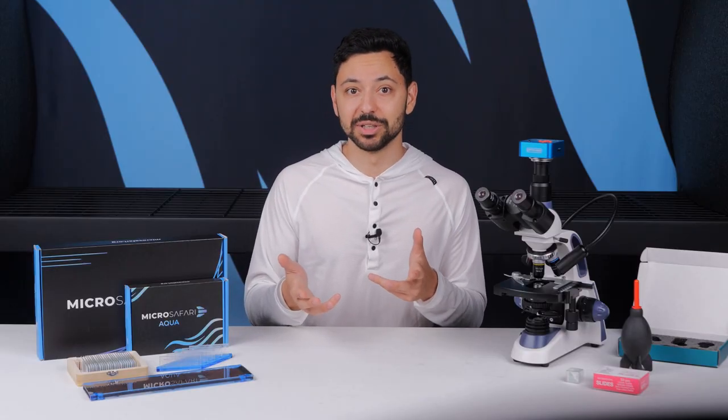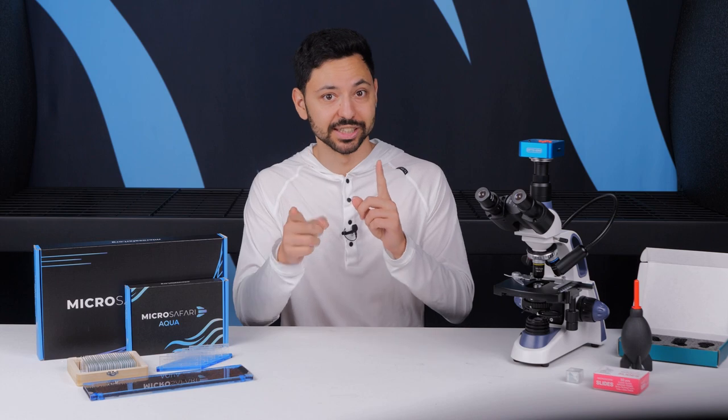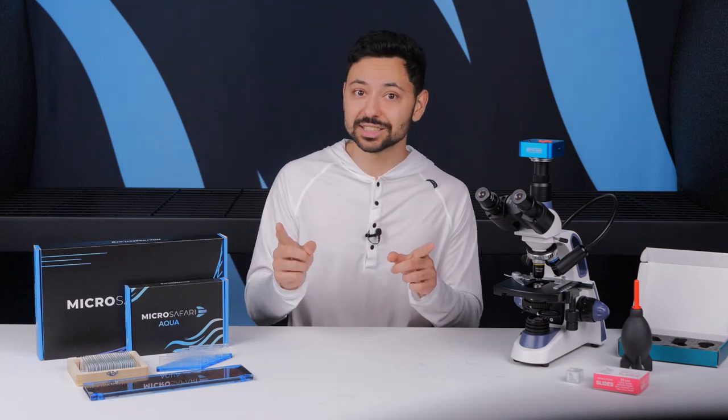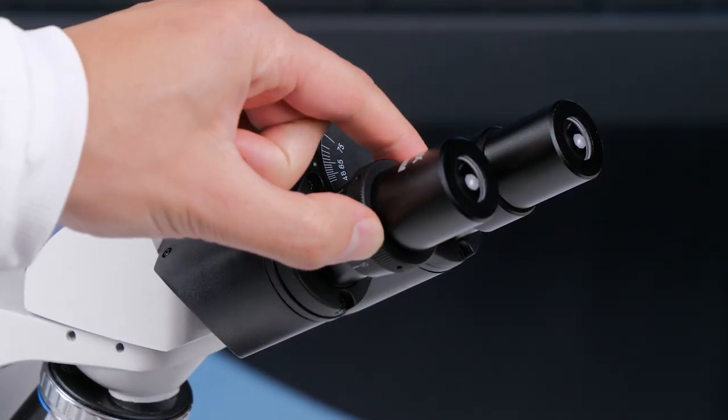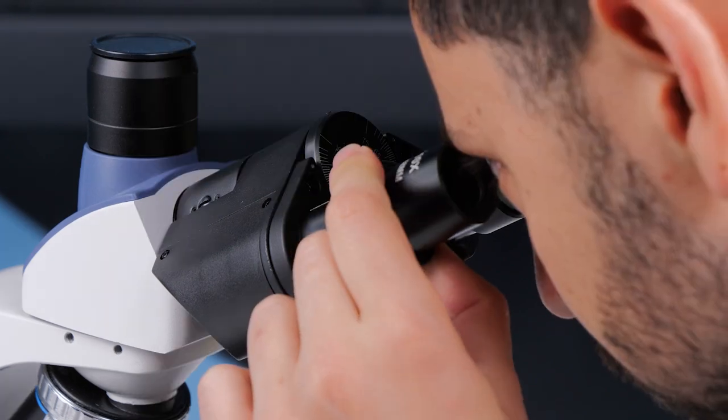If, when you look into the microscope eyepiece with each eye individually, one is in focus and the other isn't, you'll want to adjust the diopter to bring both eyes into focus simultaneously.